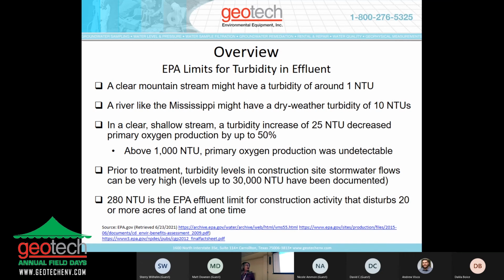So now that I've talked a little bit about the biological and environmental effects, I wanted to move on and just talk a little bit about what is high turbidity, right? Because those of you in the industry that have a lot of experience with this are probably very familiar with what these numbers mean, but for those that don't have a lot of experience, it's hard to know what we're looking for and how much variance we can see in a system. So as indicated here, Clear Mountain Stream, 1 NTU, very, very low turbidity. A very large river like the Mississippi that we think of as being fairly tumultuous in the dry weather season, 10 NTUs. Right? Still very, very low relative to some of these other numbers we're going to look at.